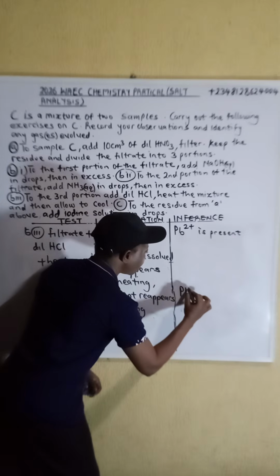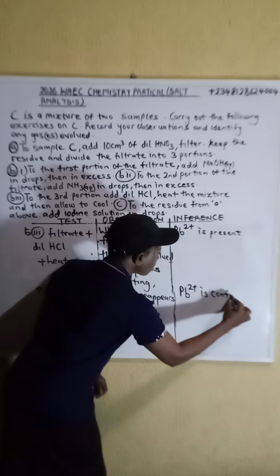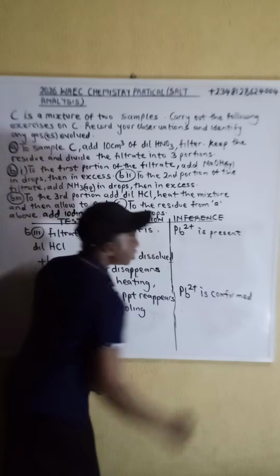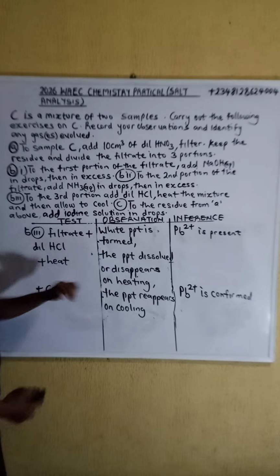So we are going to write lead ion is confirmed.